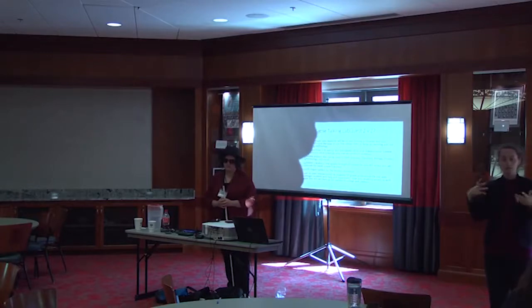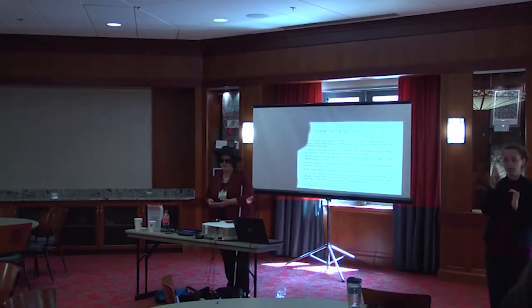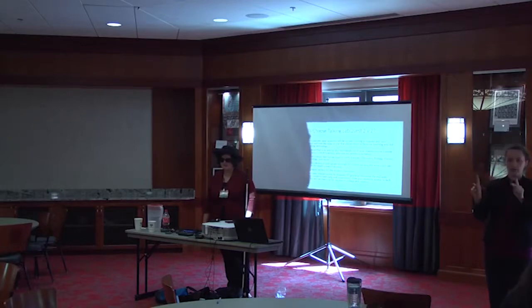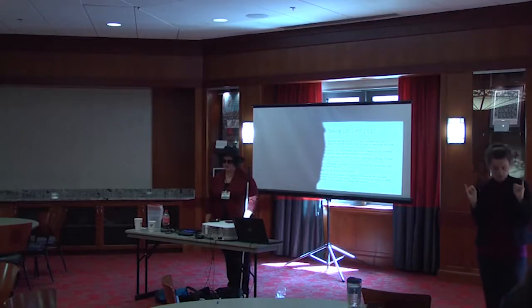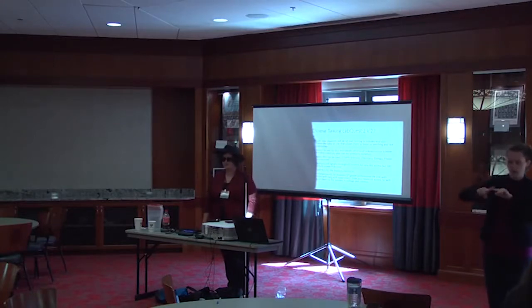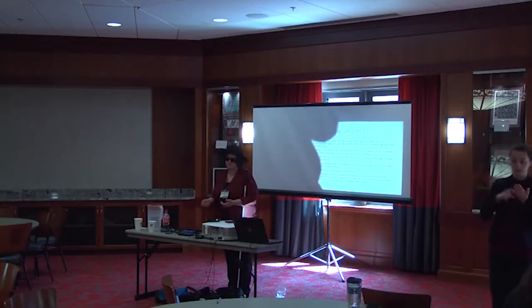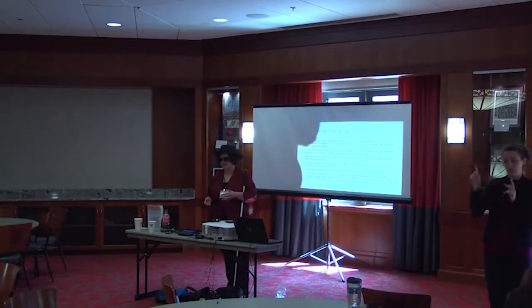But right now, it doesn't have the capability of Braille output. I'm just thinking of students who are deafblind. Right now it does not, but that's on the wish list. And the wish list must be a mile long. It is. You can never make something perfect, so we are working towards that constantly.